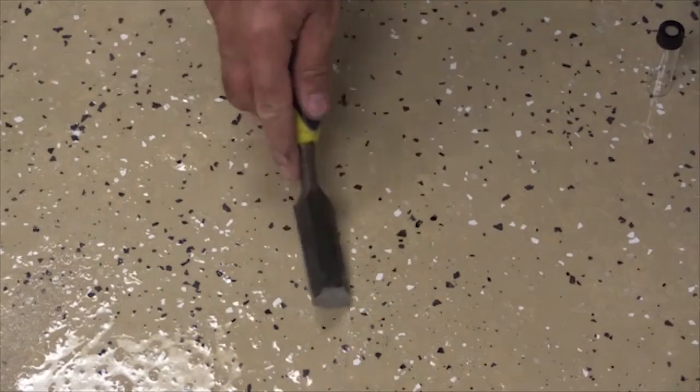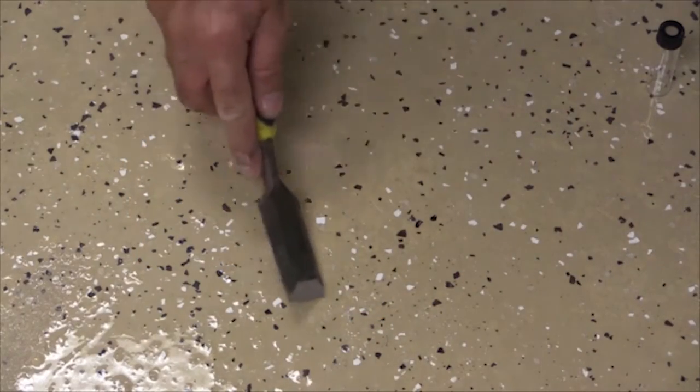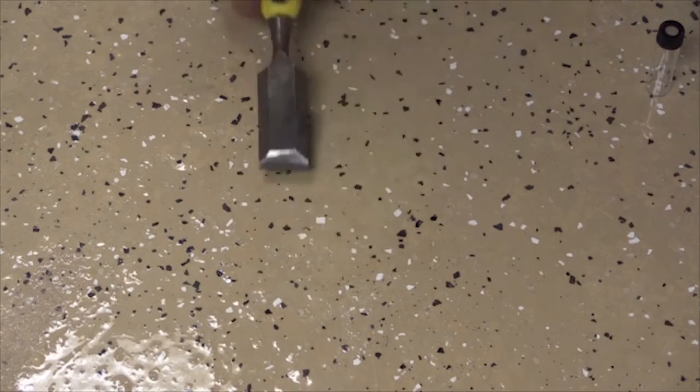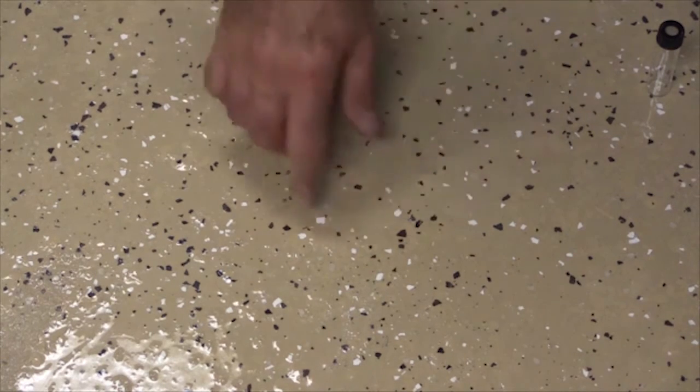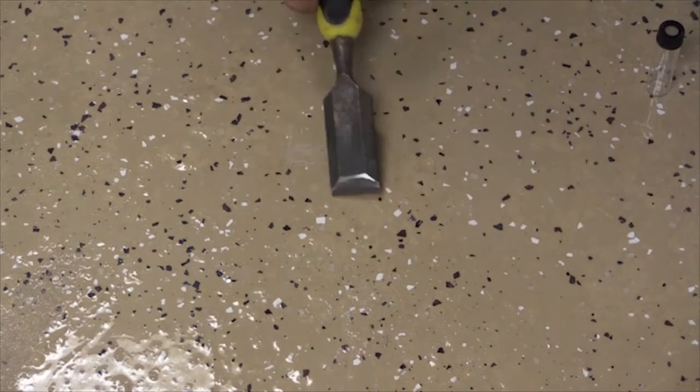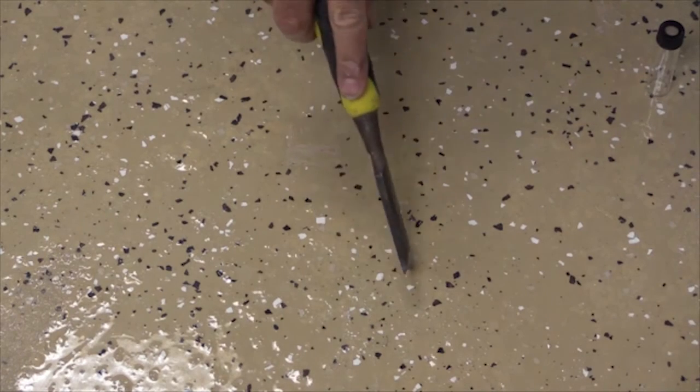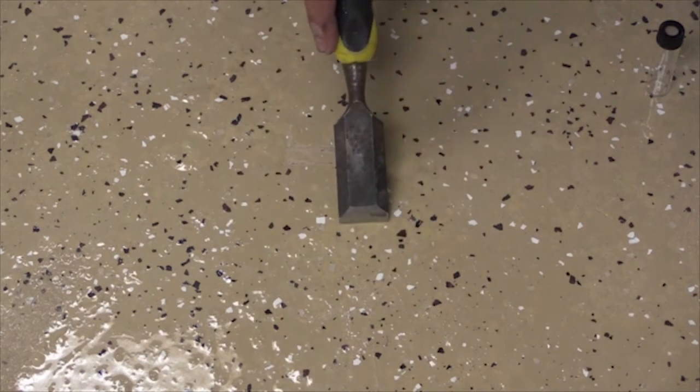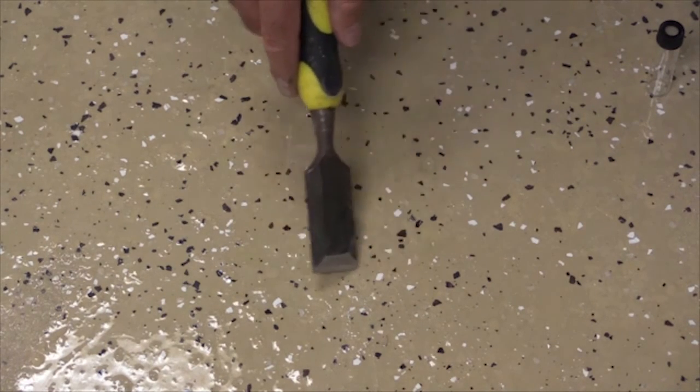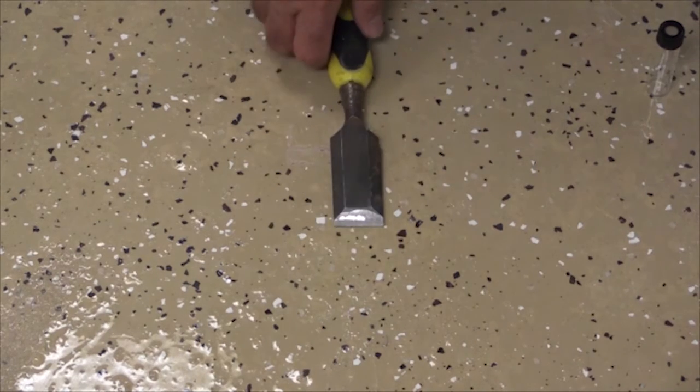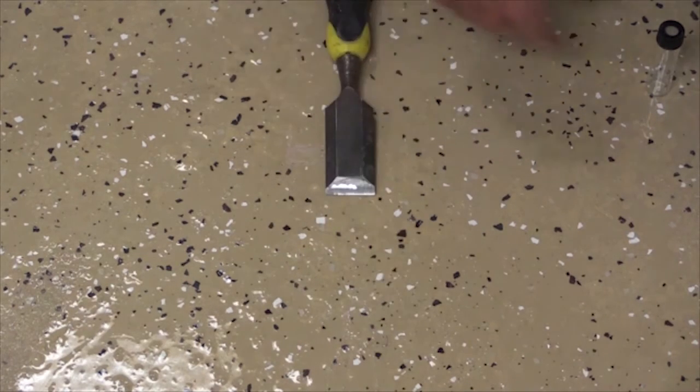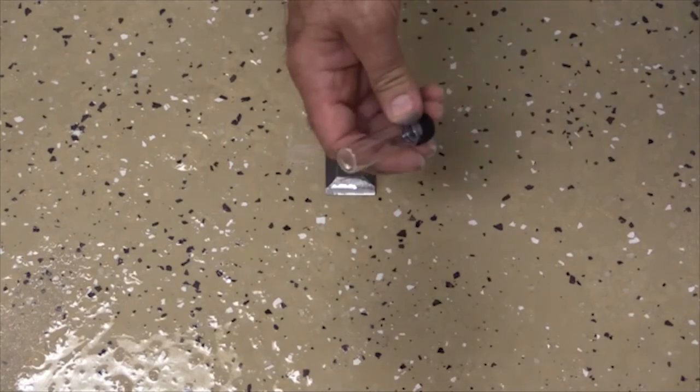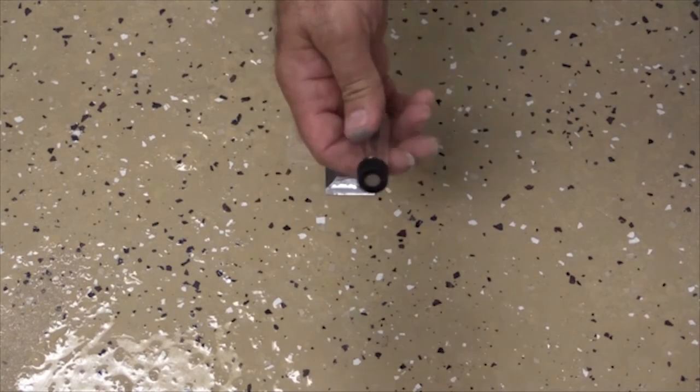What we have here is we have a blistered area on a coating system, and we want to sample the coating system in the blistered area. We suspect that maybe there's some solvent entrapped in one of those coating layers below. So what we're going to do is we're going to take our sample using a sharp chisel, and immediately when we cut our sample out, we're going to put it into this septum cap vial.